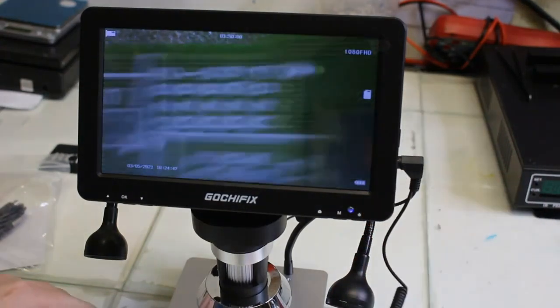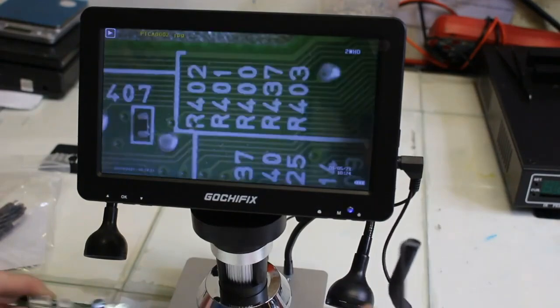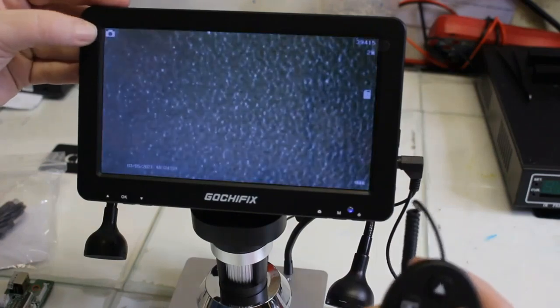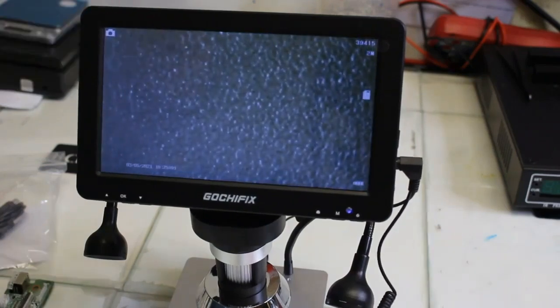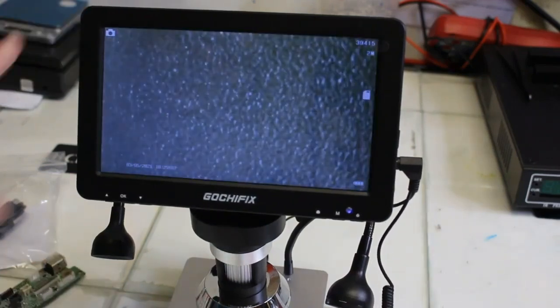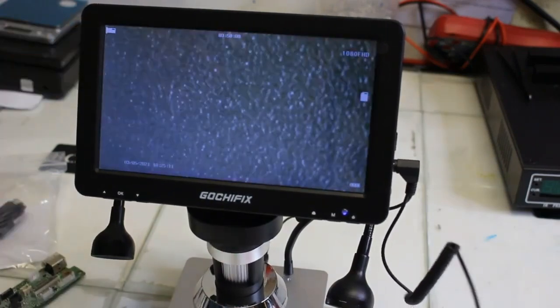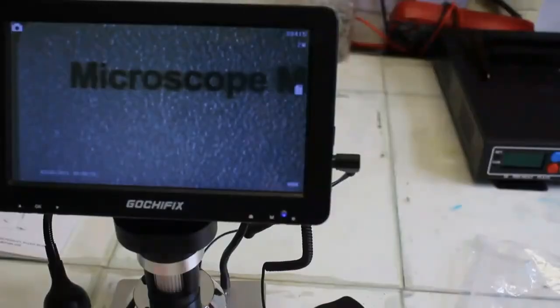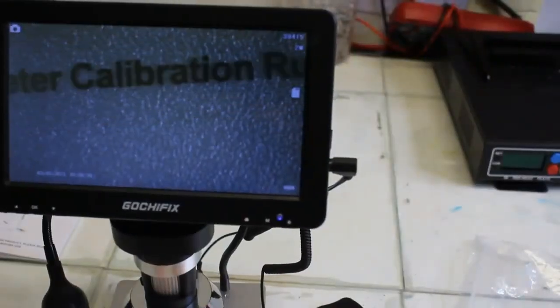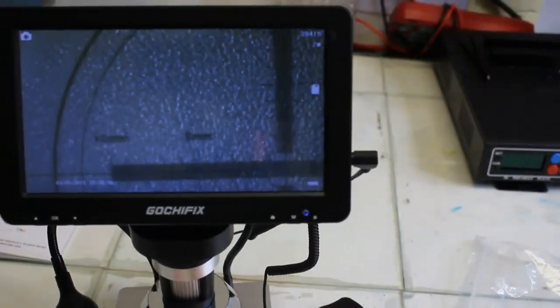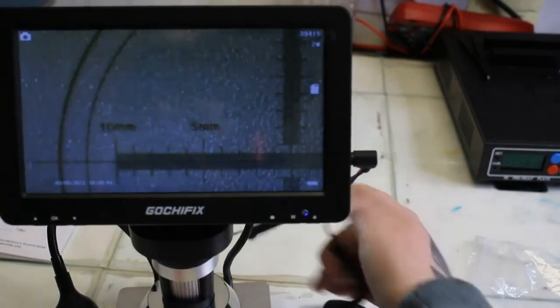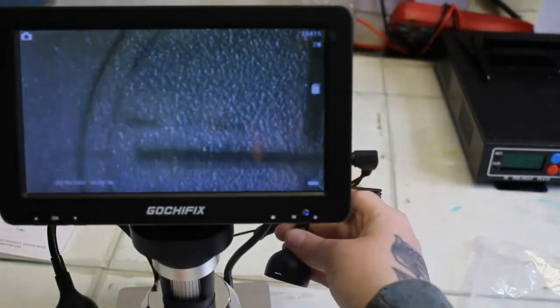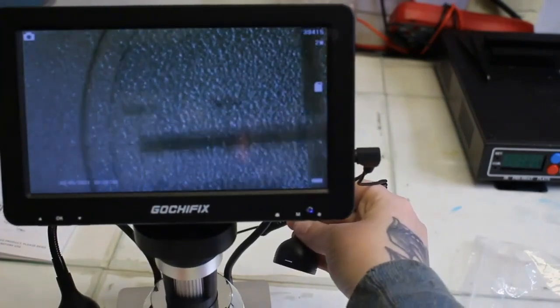Now I'm in the camera and I can take a picture. When I change it now I'm in the video. Here is where I call it the movie button right? So we can go back and look at all of our different things. I have the camera now so I can take a picture. You see the main board's not there and now the main board is out but when I went into that movie mode you could see that I had the main board out but it was showing everything that I've taken a picture of, the video etc.